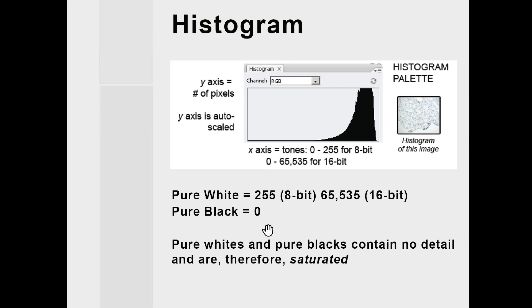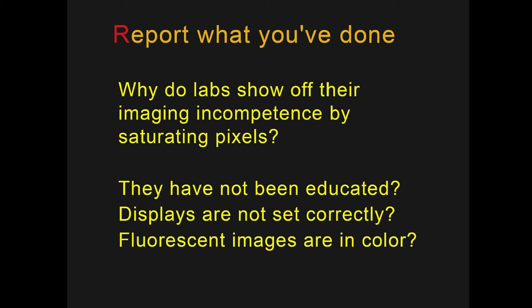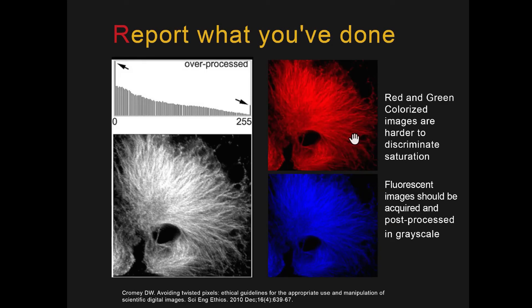Pure whites and blacks contain no detail, and are therefore saturated. You have to wonder why labs show off their imaging incompetence by saturating pixels. There are three reasons: maybe they haven't been educated, maybe displays are not set correctly, or because fluorescent images are often in color, it's harder to see when you've saturated pixels in two different colors like red and blue. Therefore, it's really important to always look at your images from a confocal in grayscale, so you can better see whether pixels are under or over-saturated. Note also that the blacks here are perfectly black, so you've lost all detail in the blacks.